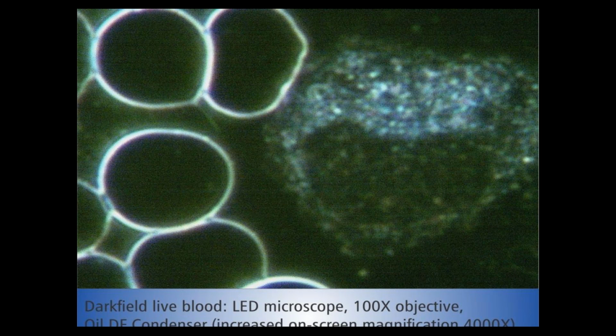Okay, now the type of camera connected to the microscope is also very important, isn't it? Is there much variation in the types of cameras available for microscopes as well? Well, yes, there is. And again, here we see a fairly wide price range between different types of cameras as well. Now, the first thing to look out for is whether the camera has been built specifically for microscopy.